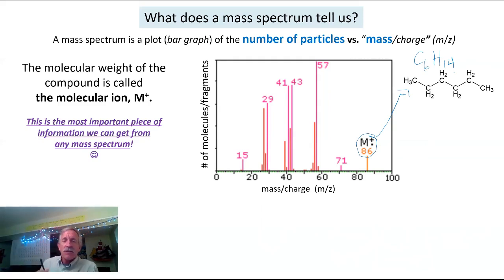Even when you start playing around with the periodic table and using the carbon 12.01 and H 1.001, these all have decimals up here. So even if you were to add it up yourself using the carbons and hydrogens from your own periodic table, you would get a decimal number. So why doesn't mass spec give us a decimal? That is the end all be all question. Why are these all whole numbers? And it is incredibly important.